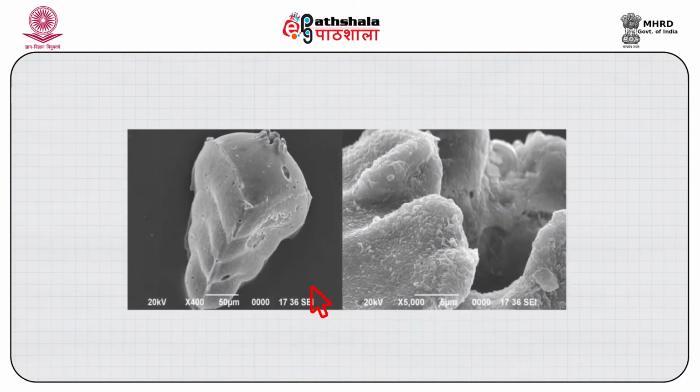As the backscattered electron image, that is an elastic scattering event, distinguished the composition, in this figure the inelastic scattering leads to generation of an excellent image where the microfossil ornamentation and parts are detailed.